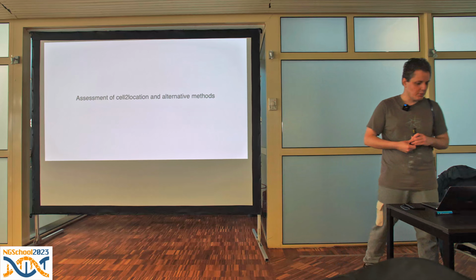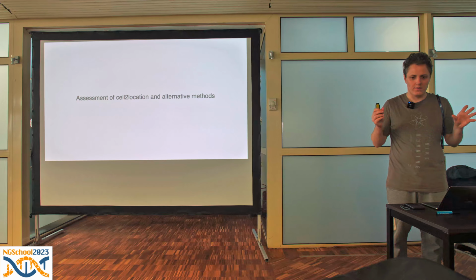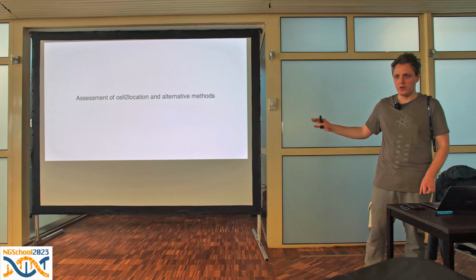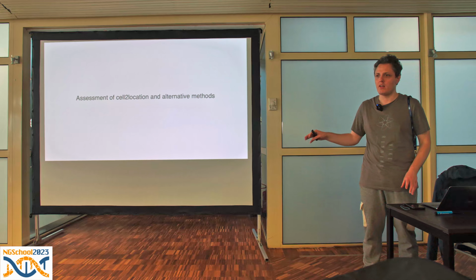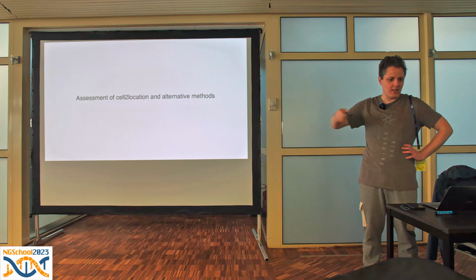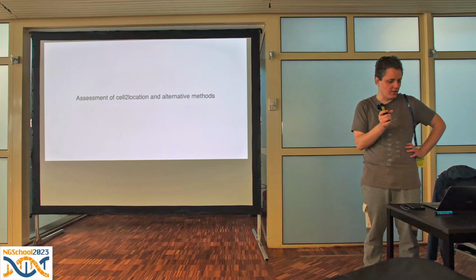Yeah, that's a very good point. So the way this method works is by spatially mapping transcriptionally distinct clusters. So what you want to formulate in the reference are transcriptionally distinct clusters, and I will show you one example of how you can do this systematically. That would help with the gradient problem, for example. There isn't any good way to map gradients at the moment, at least not that I have seen, to directly map a gradient as opposed to stages within the gradient.